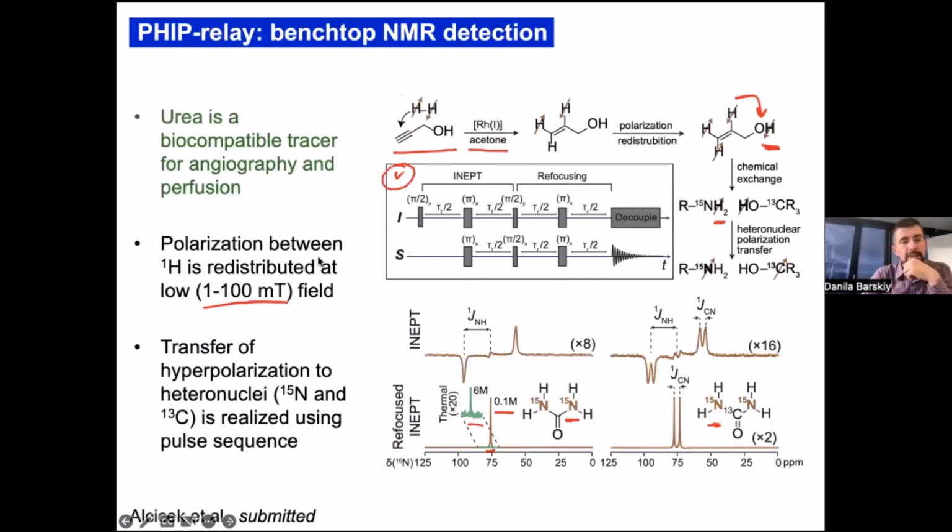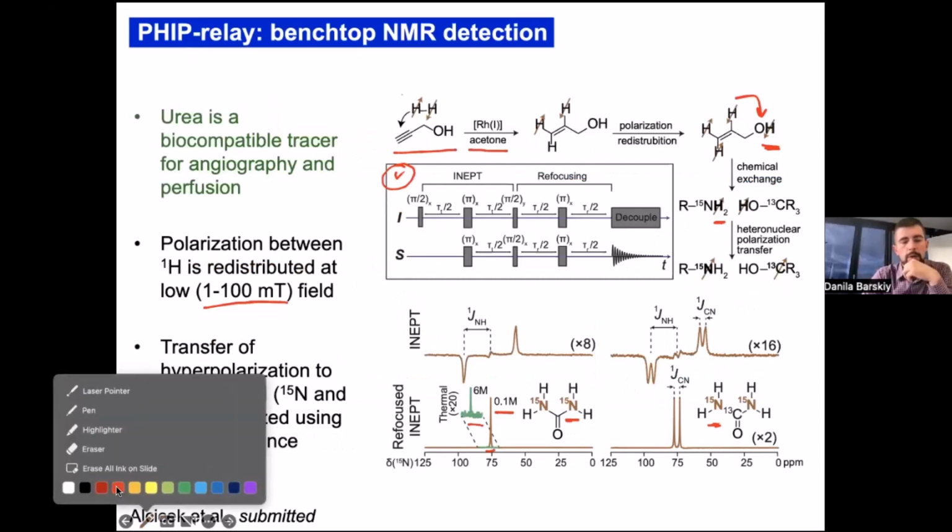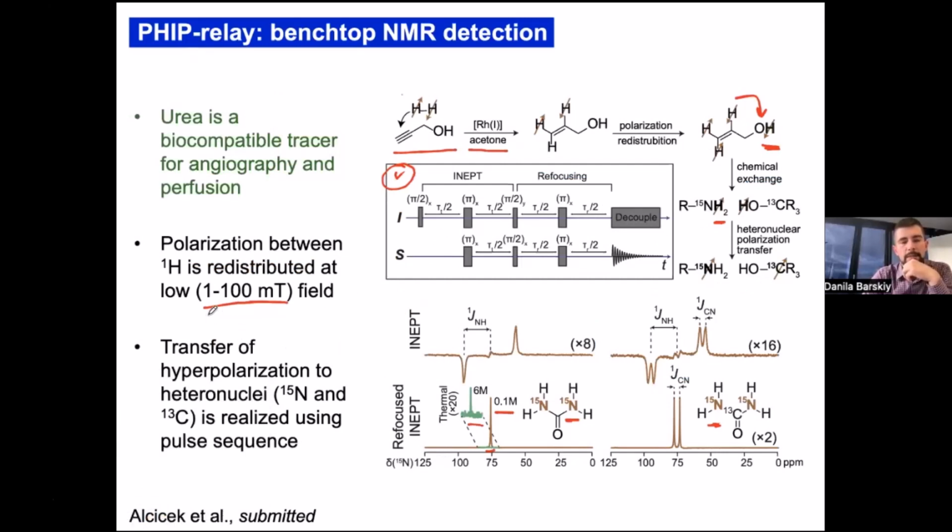At zero fields, yes. That's exactly what we tried. We only tried millitesla fields so far. In our lab, we also work with zero field NMR, so that's where we also want to detect our signals. Indeed, the next step with this particular work is to go to zero field and detect spectroscopic features of urea at zero field without any necessary polarization transfer scheme.